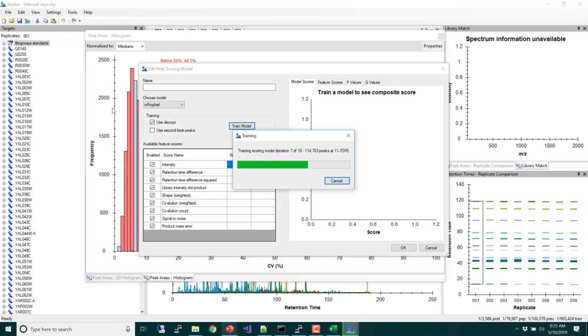And this is what the MacCoss lab is definitely focusing on. Our favorite clinical collaborator, Andy Hoofnagle, is the one who came up with this idea with Mike to have Lindsay do the calibration of the entire yeast proteome so that we could get what are called figures of merit on every peptide that we were going to analyze. Some of them degrade, some of them have a linear range, and some don't behave very well at all.